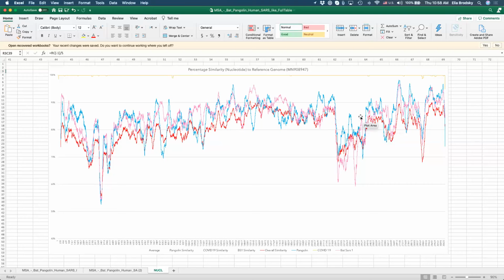What do you think might be the region where we see a lot of dissimilarity? What are some of those regions that you see here with a lot of dissimilarity? Okay, close to 3400. Okay, 22,000 to 25,000, right?